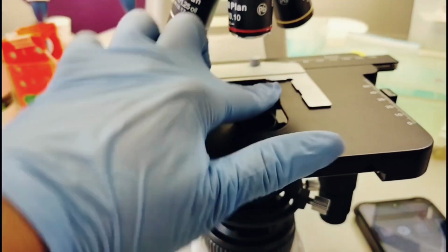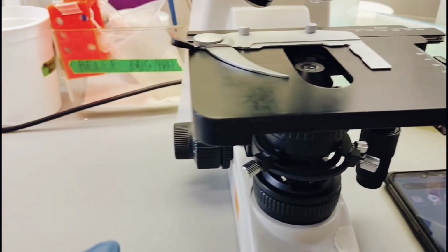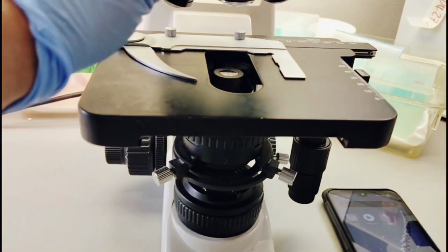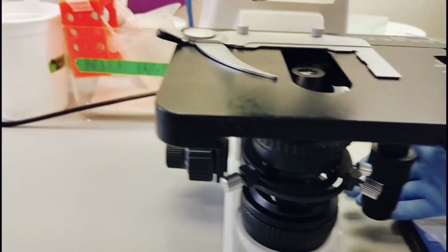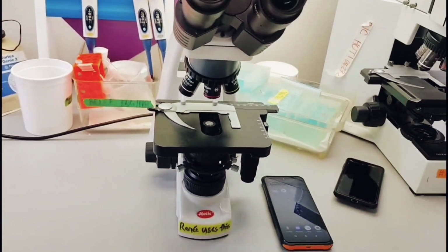When you're done with the scope, you wipe it down, you turn off the light, because you'll blow the bulb, and then you leave it on the lowest magnification. So you put it back at times 4, and then you lower the stage. So yeah, I'm done.